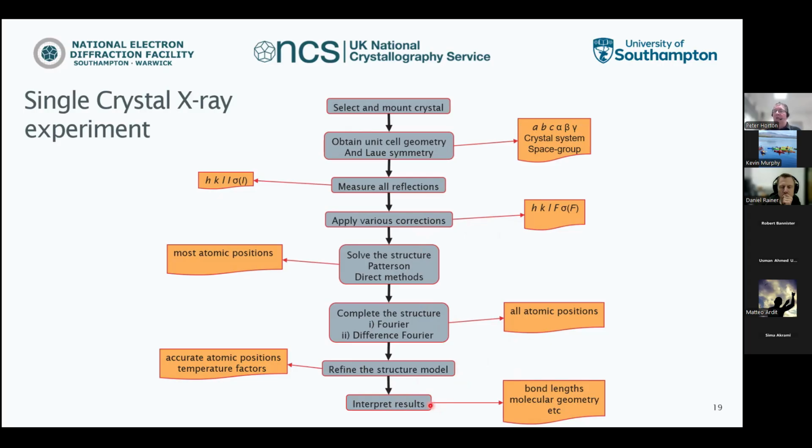The one thing from a crystal structure is you get a lot of extra information. We will know not only the atoms involved, so which elements they are, but also how far apart they are. So you can get things like bond lengths, angles, geometry, and it's a 3D representation. If you're lucky, you can get chirality as well and know a lot of things about the structure. Sometimes it can be useful for other techniques too: if I need these metals to be so far apart in my refinement, are they or not? You'll be able to find that information out.